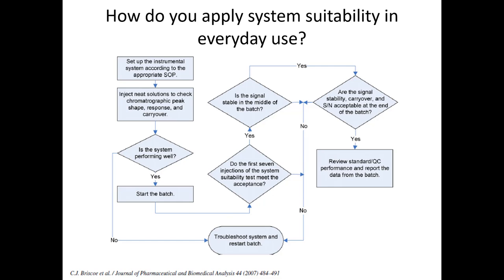So for people that are like, how often should I run it? How should I run it? This is a nice flow chart in this paper, published in 2007, discusses the whys and the hows specifically, but this is just a nice flow chart where you set it up, inject your solutions, make sure everything looks good. Is it performing well? Yes, start your batch. And then decision points on when you start seeing changes, what you should do.